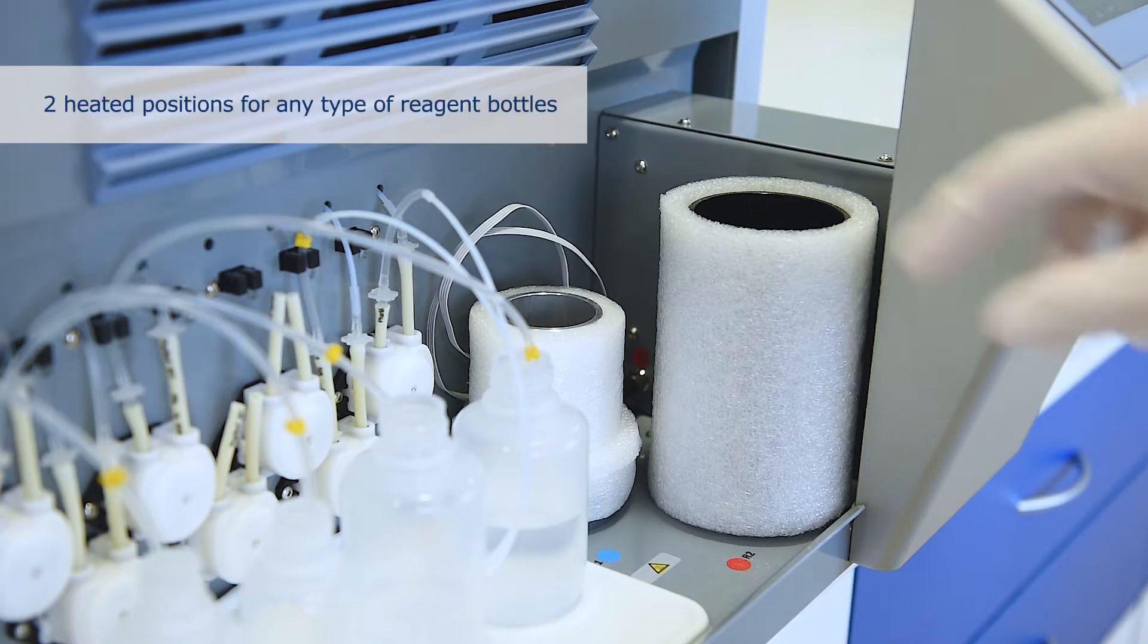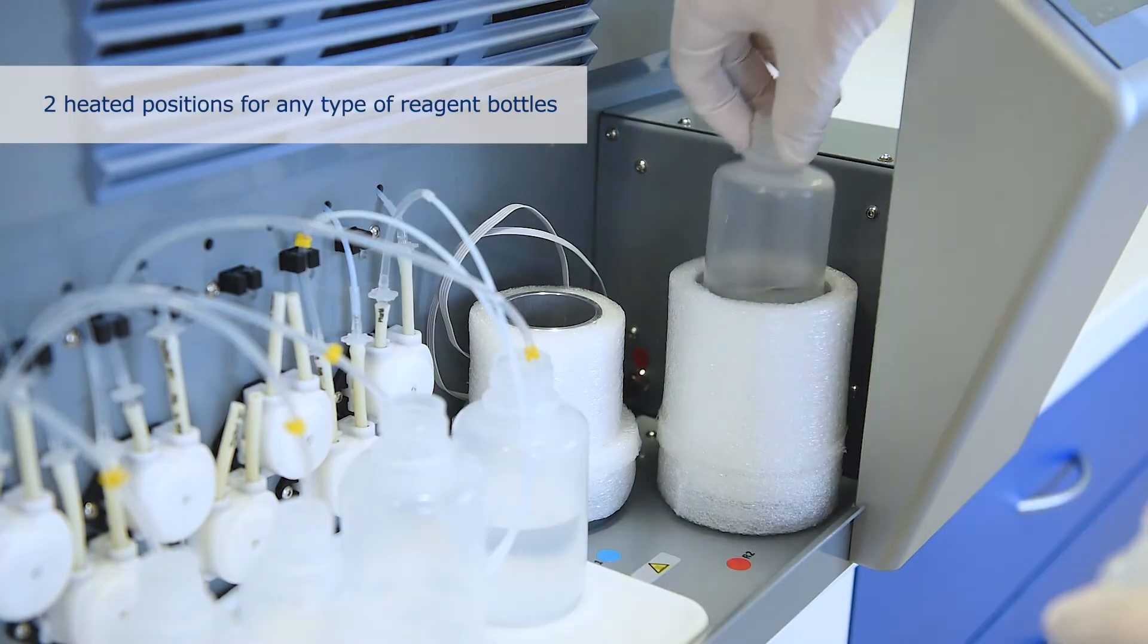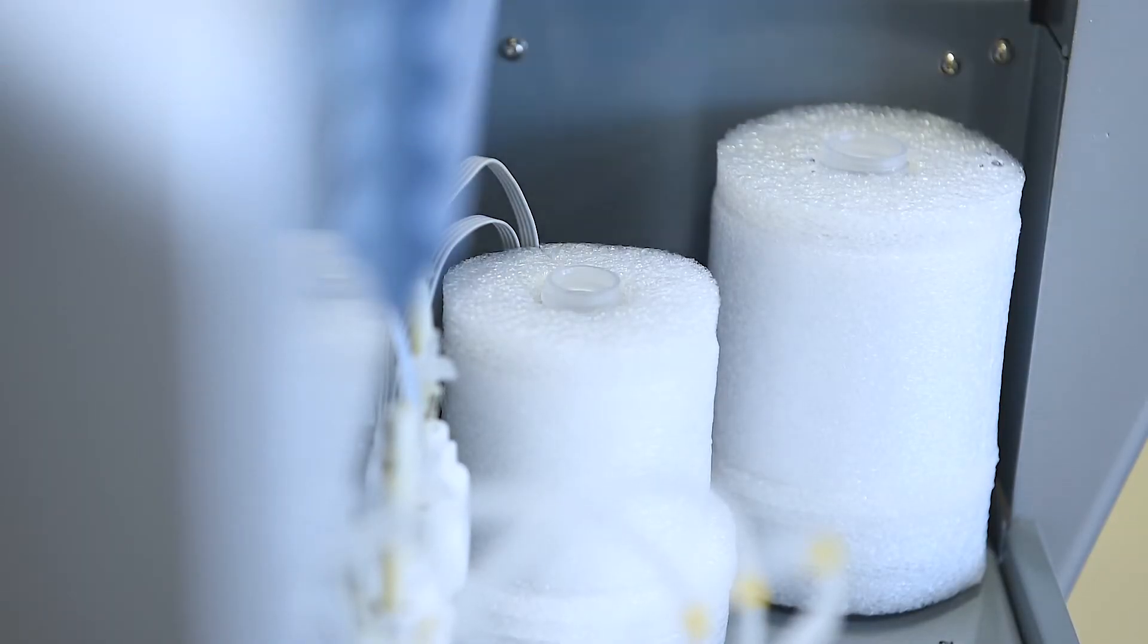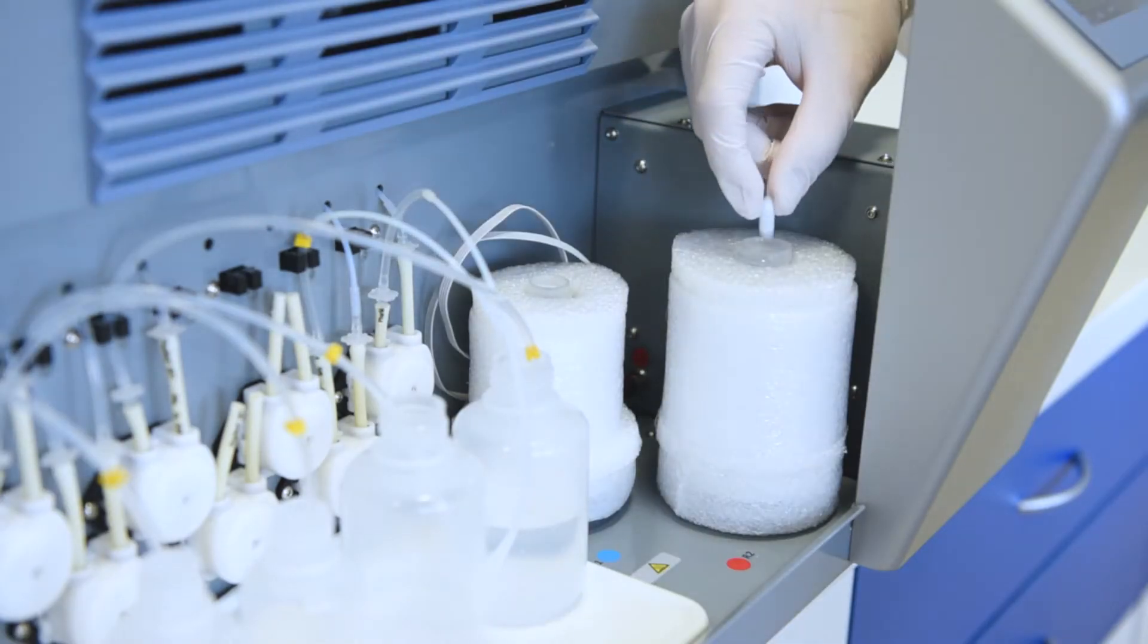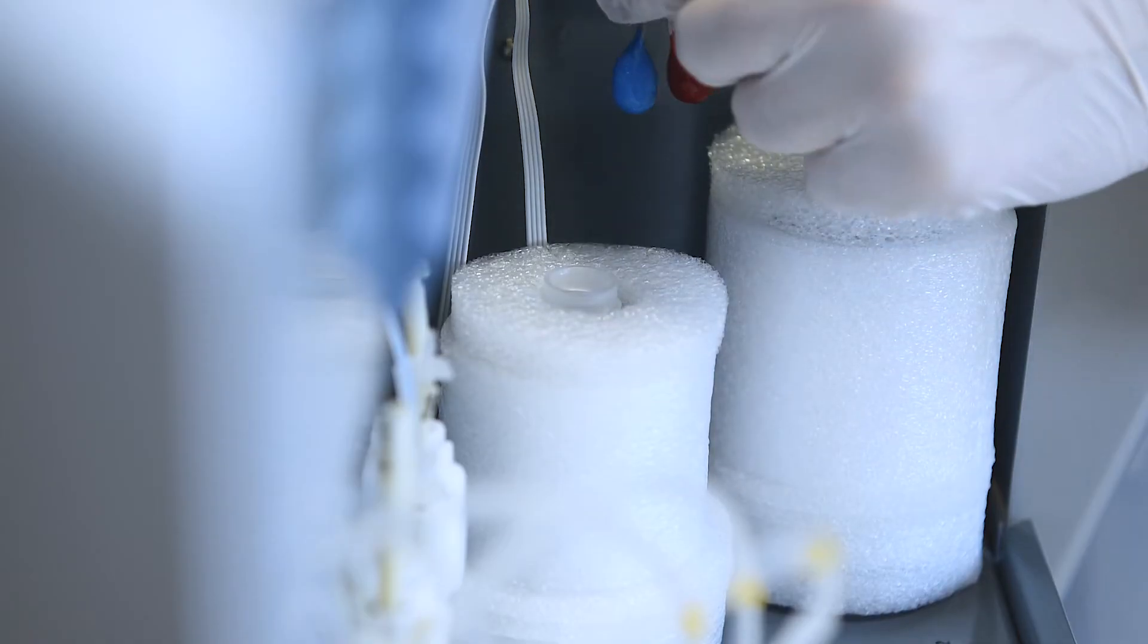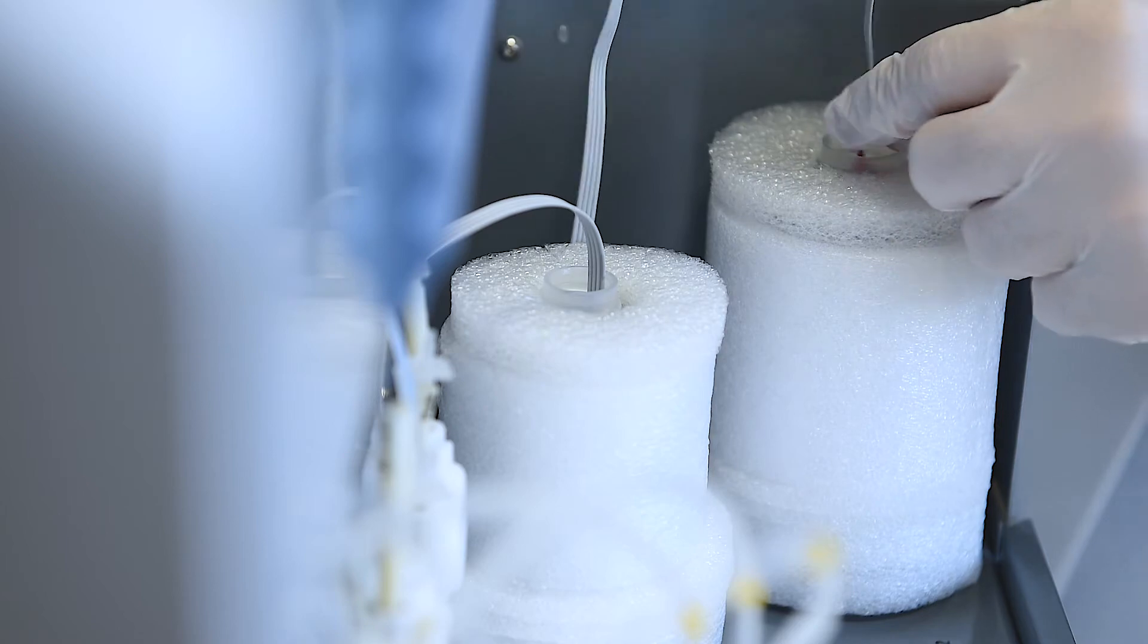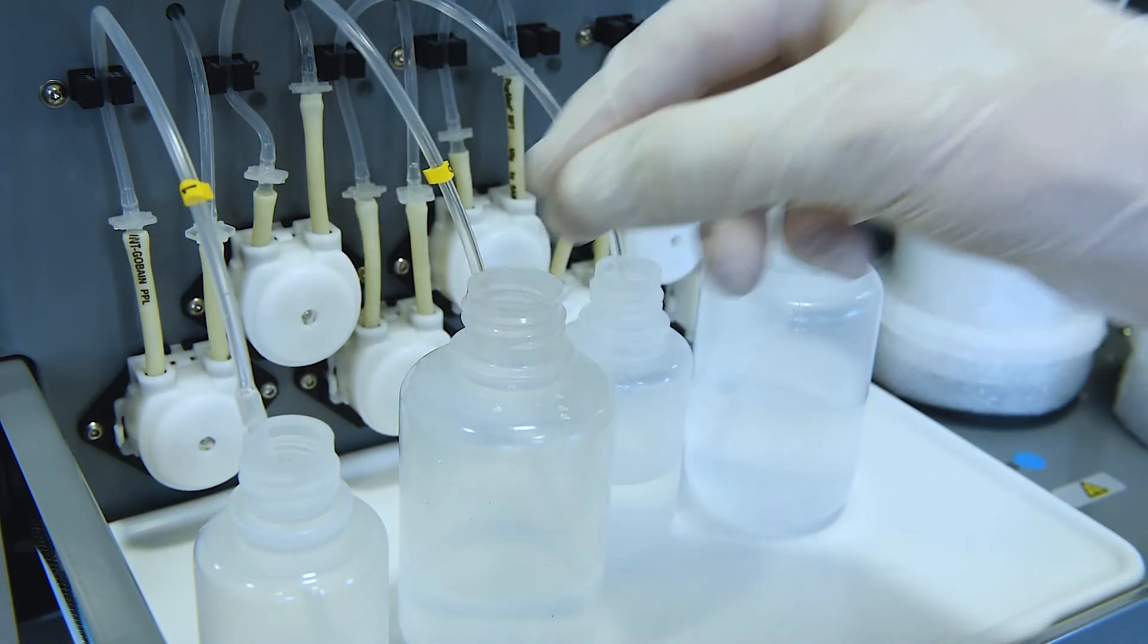The drawer also contains two holders for heated reagent bottles that can be mixed by the magnetic stirrer. The holders are equipped with customized adapters for different types of reagent bottles. The temperature probes directly immersed in the reagents enable the preparation time to be shortened before the protocol run.